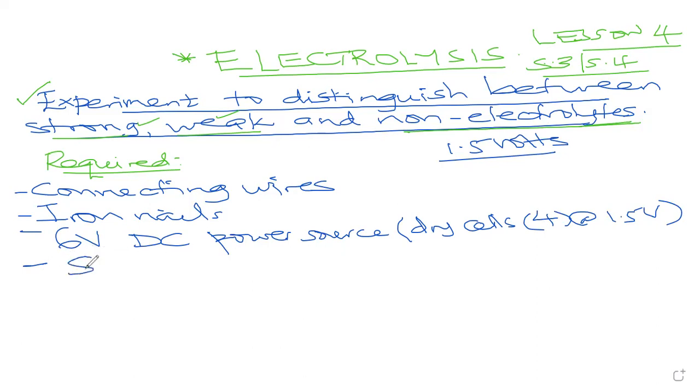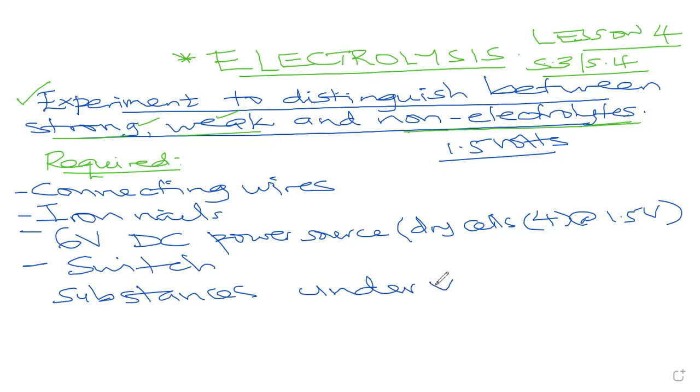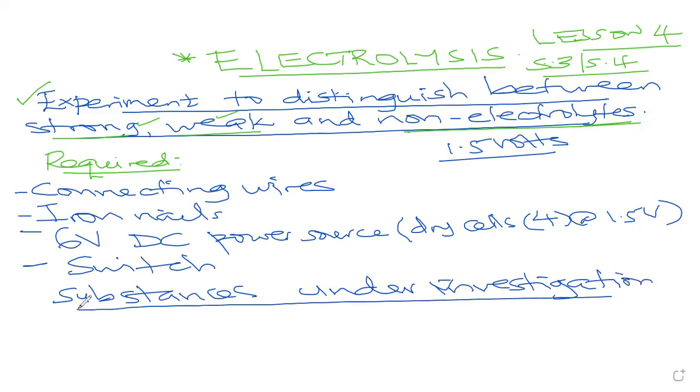We need a switch for this experiment. And we also need substances under investigation. It is these substances that we shall see whether any of them is a strong, a weak, or a non-electrolyte. Okay, so we have ethanol.